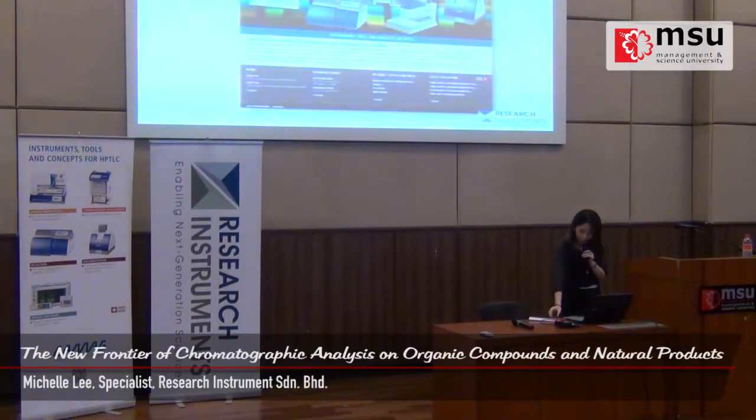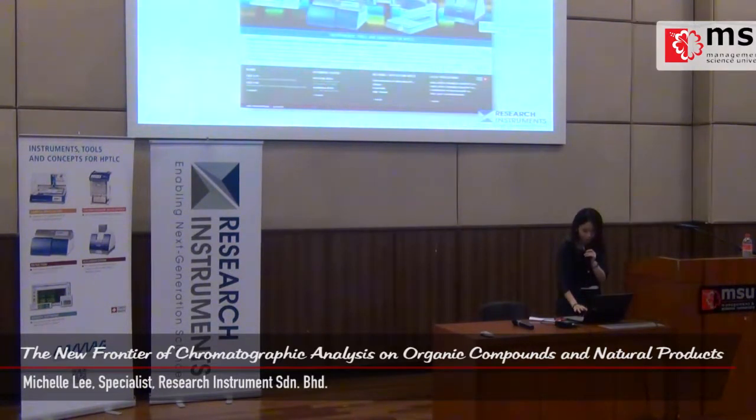Okay? So last but not least, just to share with you the last video, which is actually on our HPTLC VisionCATS software. So the software is actually called VisionCATS.